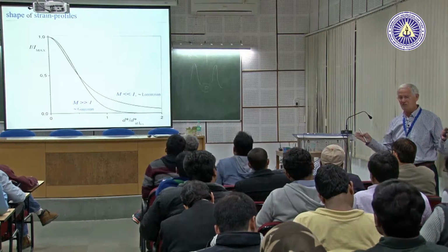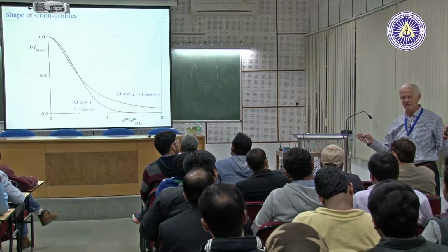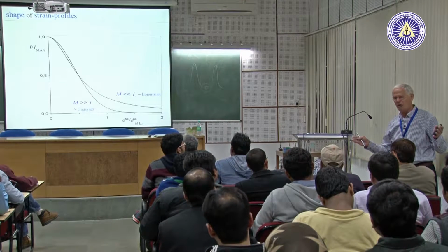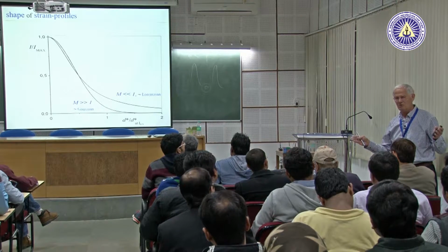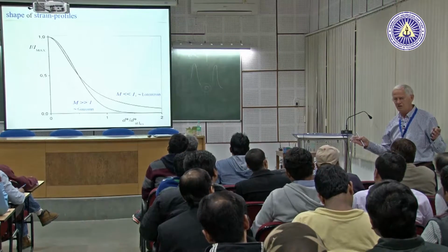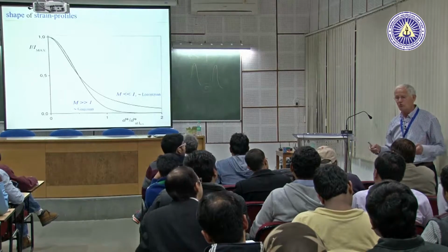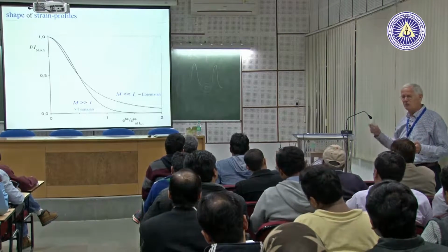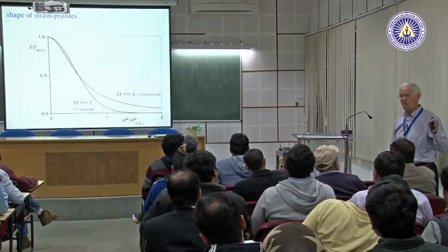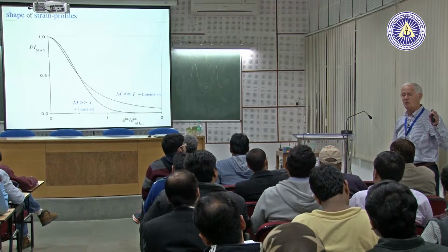So what about the Rietveld Gaussian and Lorentzian fraction of the profile function? It doesn't make sense. Okay? I'm trying to convince you that it is better to use this approach and leave Rietveld for the application for which it was invented.